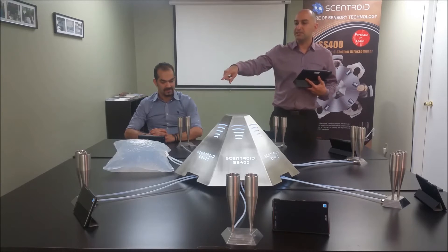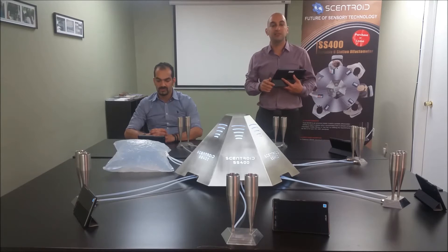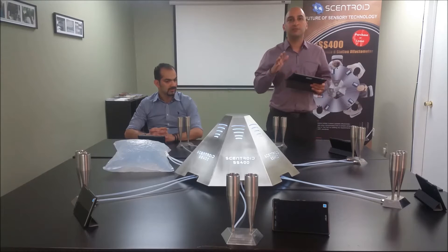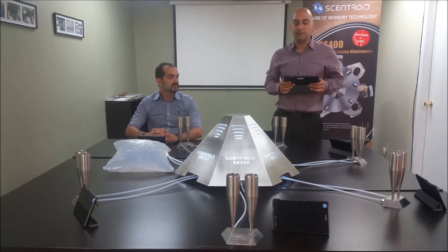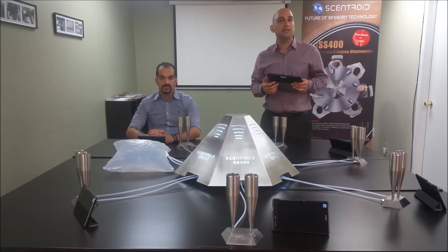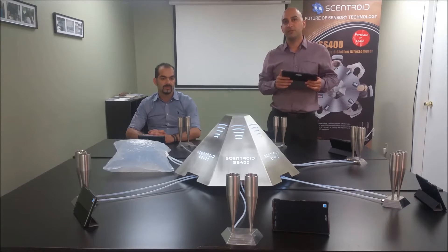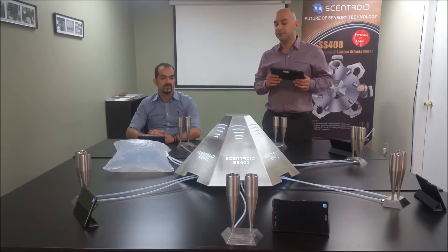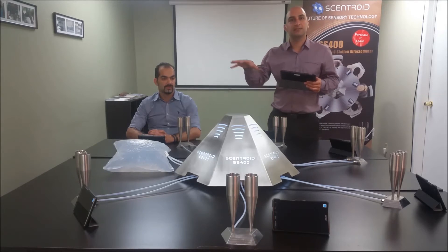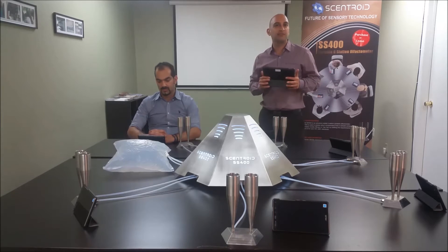Each of these individual tablets used for the panelists are also connected to the central pyramid. So how it works is I can control everything about the instrument from my tablet here — this is the admin tablet. I can start a new challenge, command it to do a cleaning, view results, and share those results with the laboratory information management system. All the while I don't have to sit in a fixed location — I can walk around, see what they're doing. It gives you a little bit more freedom.